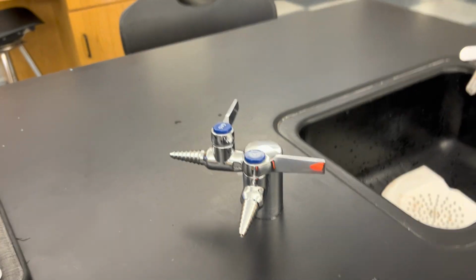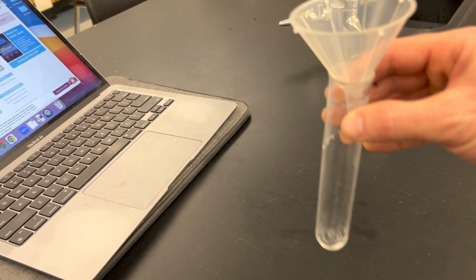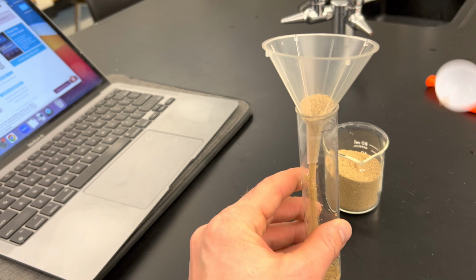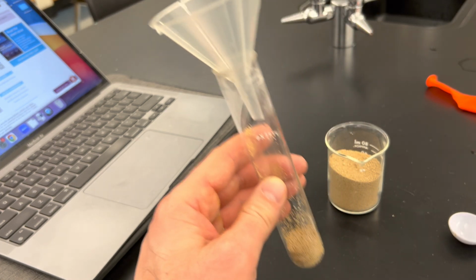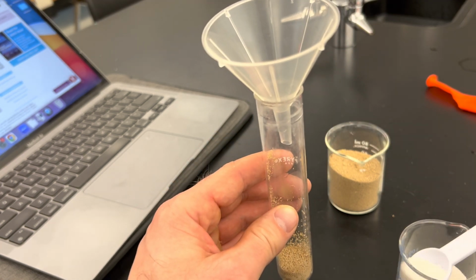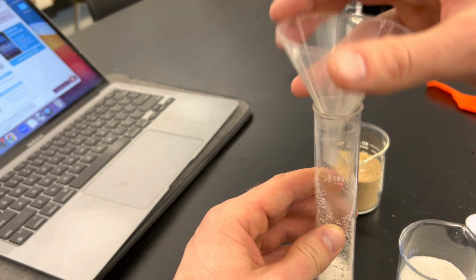I'm actually gonna move all my stuff over here. So to set up the lab, we have our consumers, our yeast, 1 tablespoon in here. Now, there's already oxygen in here based on what we saw in the sim. So now let's see if we give it some energy storage molecules, maybe 1 tablespoon of sugar.